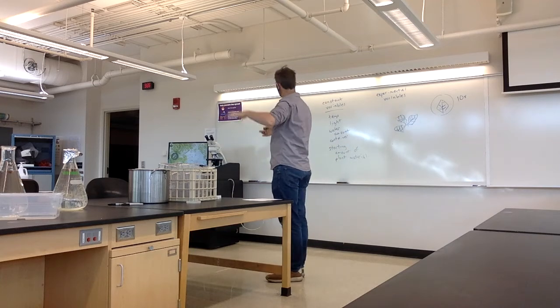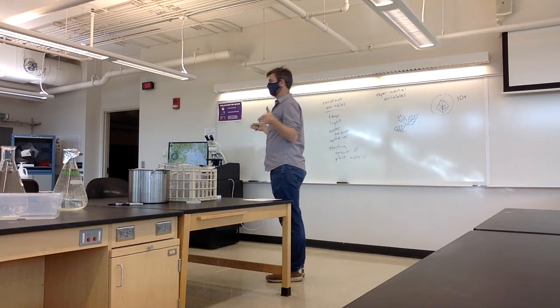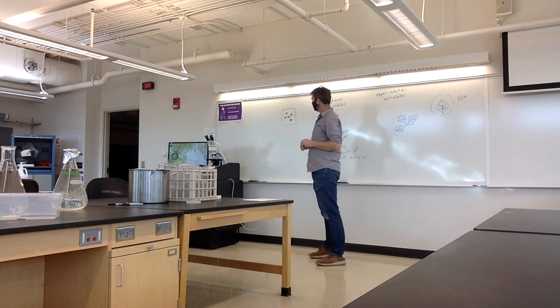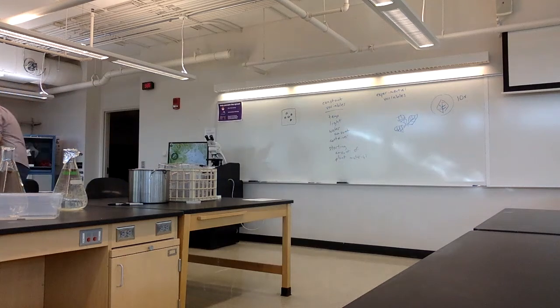So dark versus nothing. That would just measure the coverage. Okay. So we can actually watch them grow over time doing that. Let's plan for that. I guess I'm kind of working this out with you. I haven't done this before.